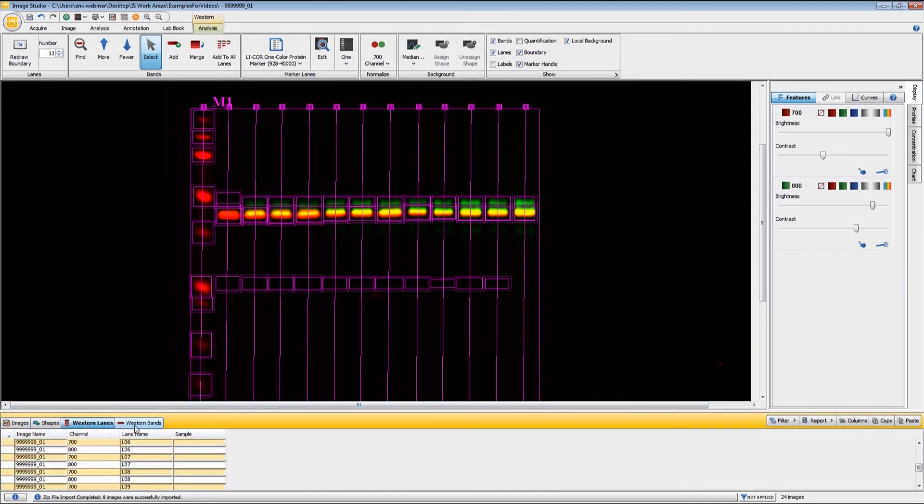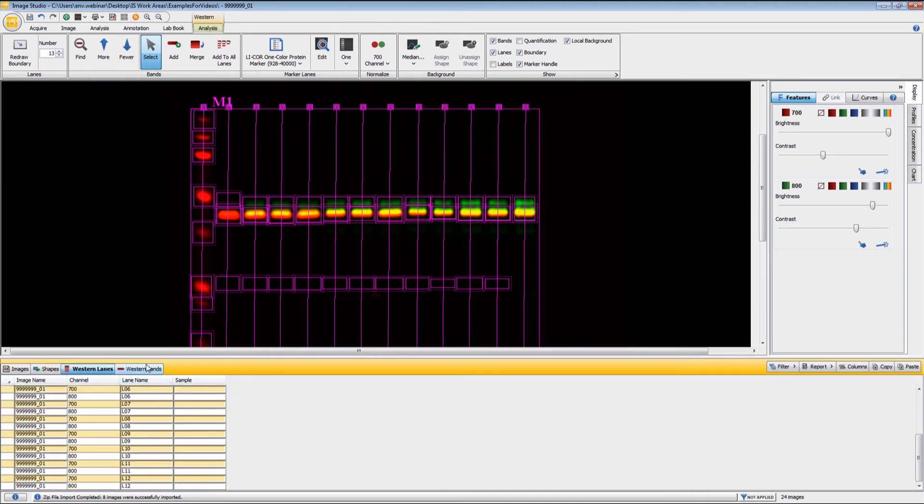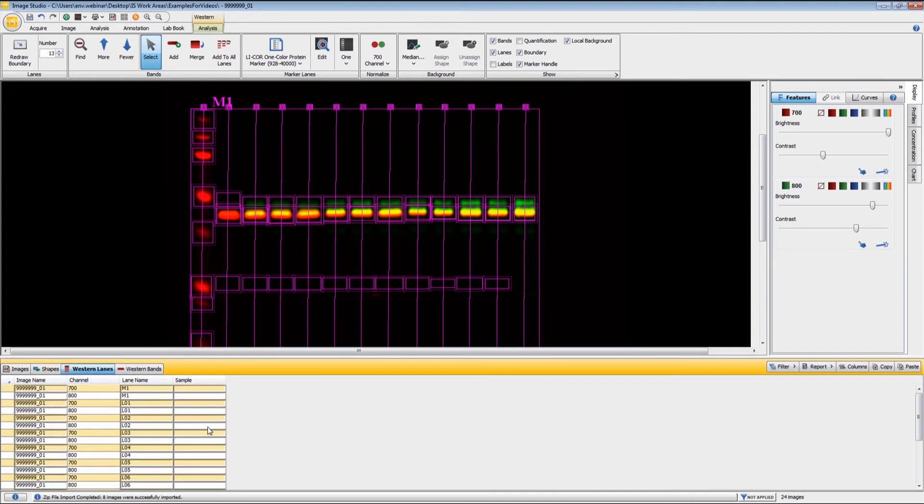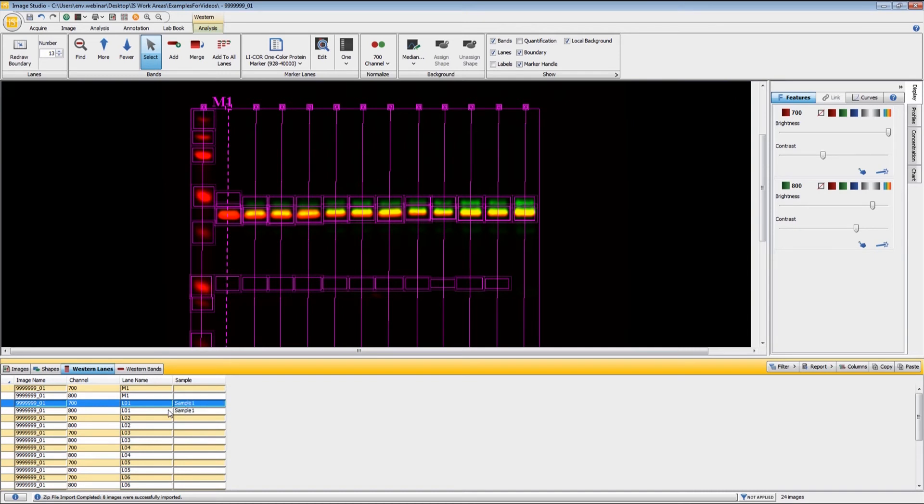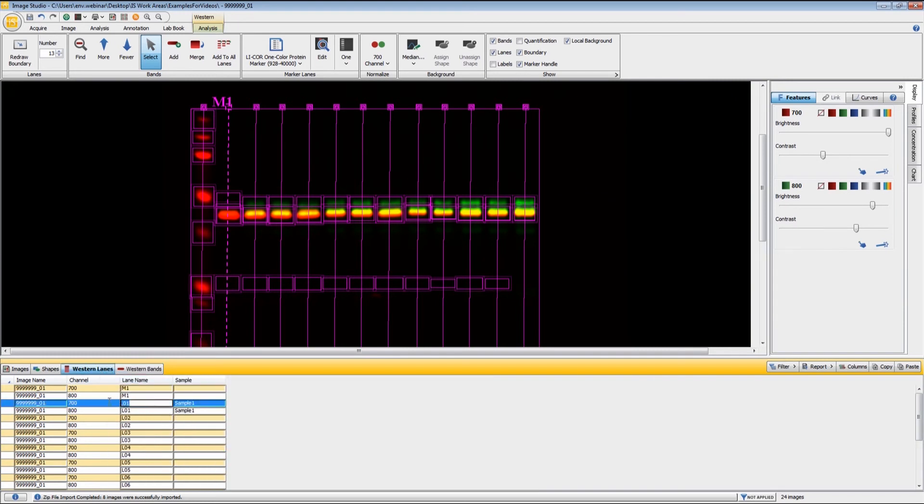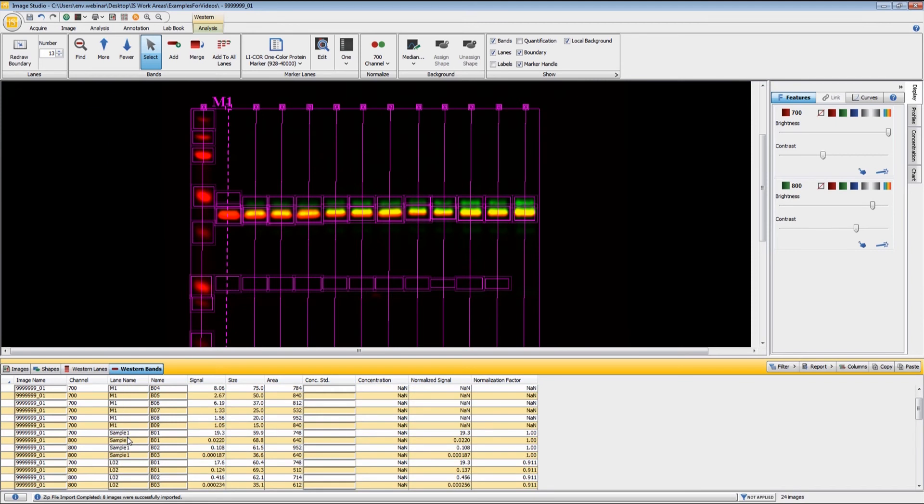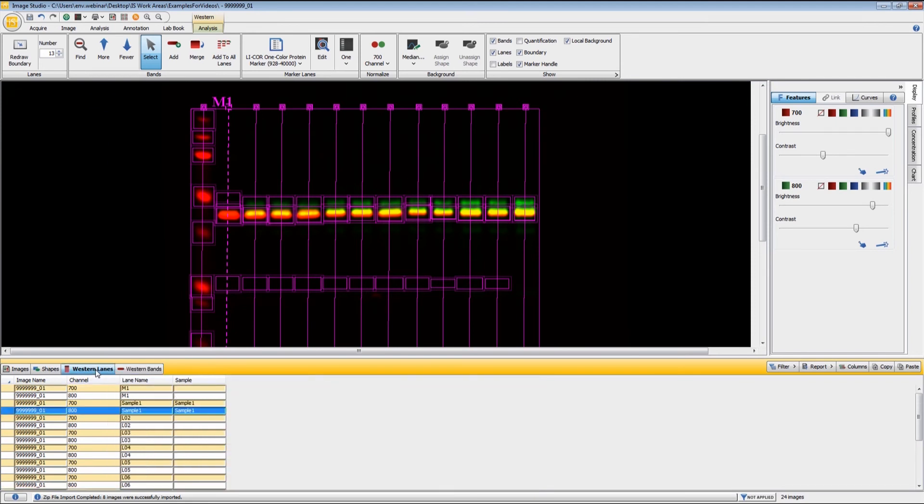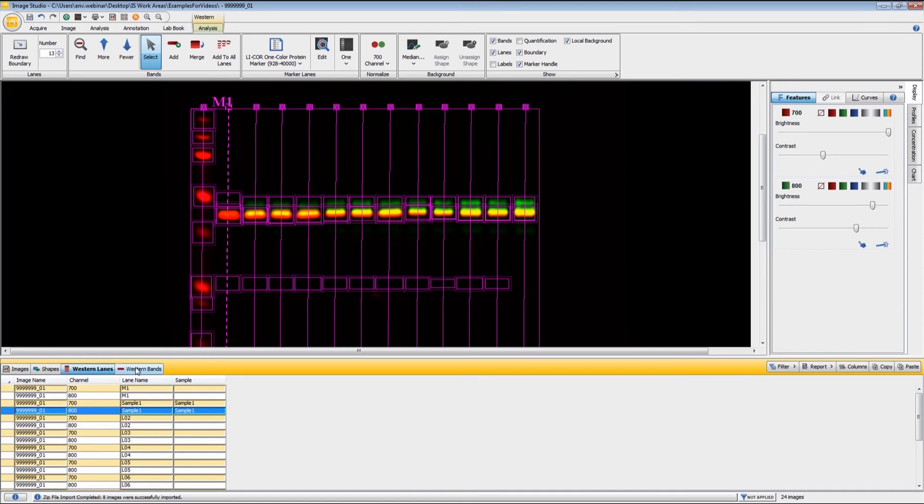With the Western analysis, we get two new tables down here at the bottom. One is the Western lanes, and one is the Western bands. Here, if I wanted to label what my sample was right here, I could just type in, this is sample one. And then that will be carried over into the bands table as well. If I change that name, under lane name, you will see that sample one has been carried over to this point. That's really what the Western lanes table is used for, is for naming your samples.